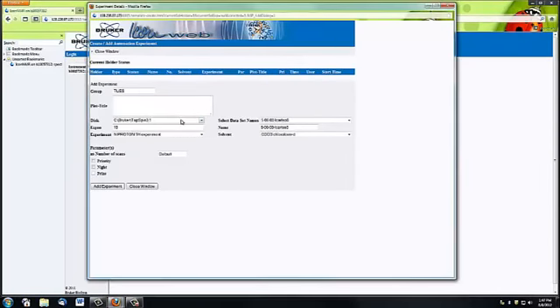Next, you'll need to choose a title for your spectrum. This title will be displayed on the spectrum itself once processing is complete. Here, we see the directory and experiment number under which your experiment will be saved. You don't need to change these.